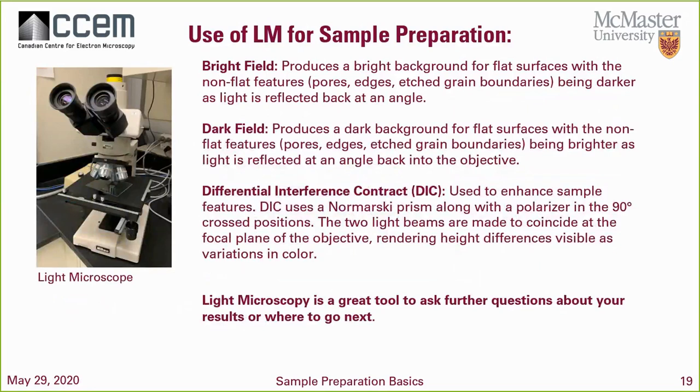Now, like I was emphasizing before, the use of light microscopy is important. And I want to emphasize three modes here that have helped me when I'm preparing samples. So bright field, which is the conventional way of looking at a sample, produces bright light on a flat surface, and then the non-flat surface features will stand out. They'll be darker because the light is reflected at an angle, like pores, edges, and grain boundaries. Dark field is the opposite of bright field. Again, dark background and the non-flat features, like the pores or the edge grain boundaries, will look brighter.